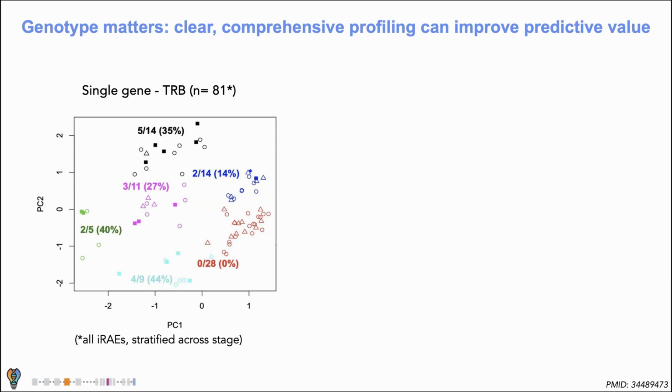did TCR beta RNA sequencing. So they sequenced the TCR beta chains that were circulating in the repertoire, and then they inferred the germline content or the genotype from that RNA data. So based on the genes they saw in the repertoire, they could say, okay, those genes are also in the DNA. And then they associated which genes these individuals were carrying with the presence and severity of immune-related adverse events, or those IRAEs, like I discussed earlier.